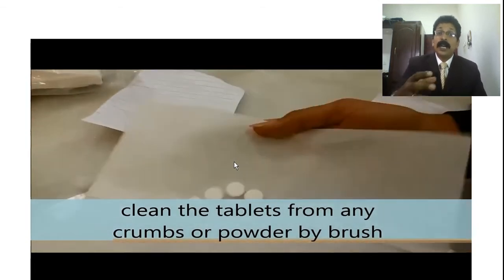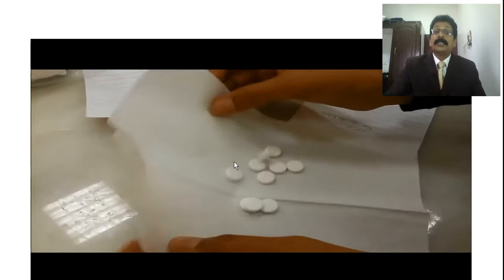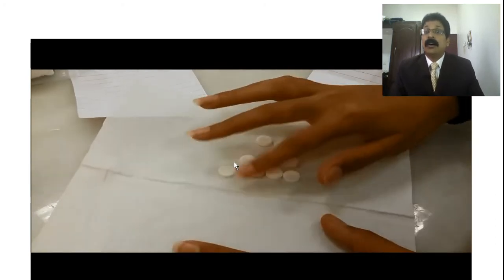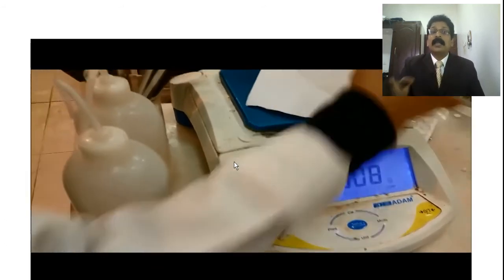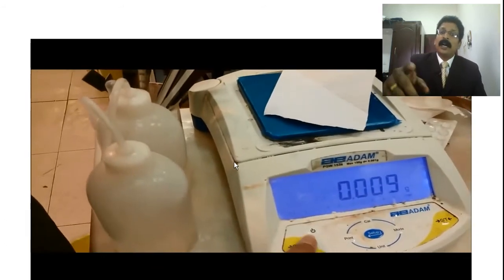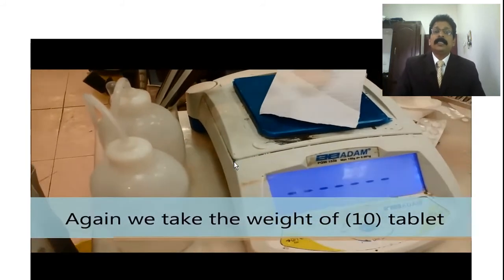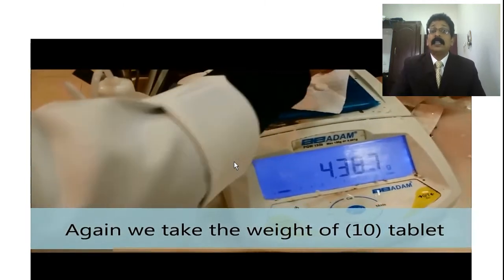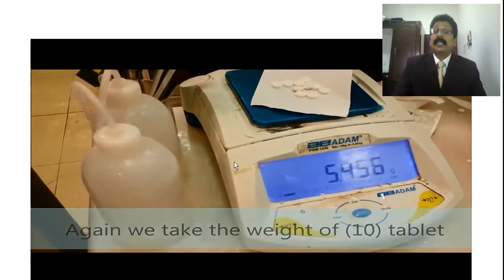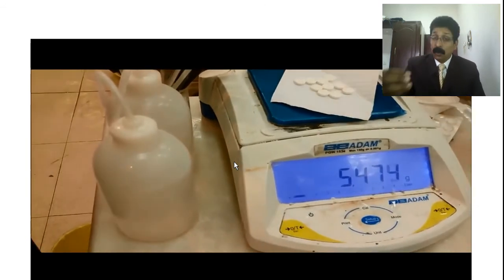Then you have to clean the tablets. After that, the same tablets are removed and you have to dust them, as written in the previous slide. Dusting off means that if something has come off the tablet, you remove it, and then weigh the tablets again. After dusting, you weigh the 10 tablets again, and the tare weight should be subtracted. Only the tablet weight you have to take, and there will be some losses.